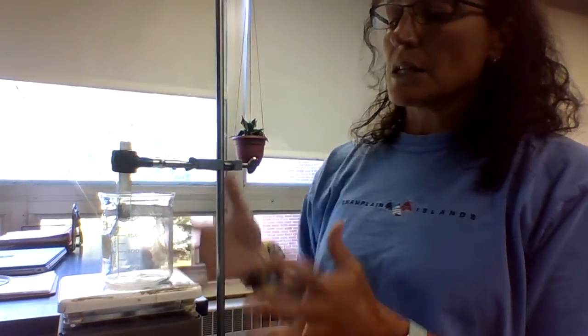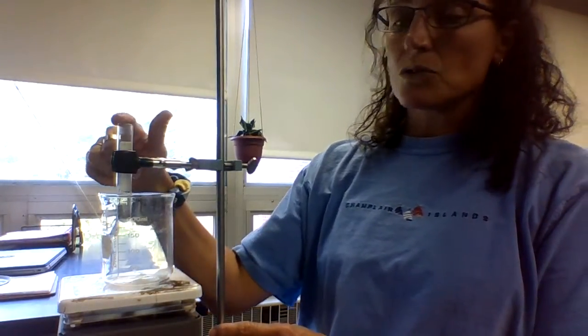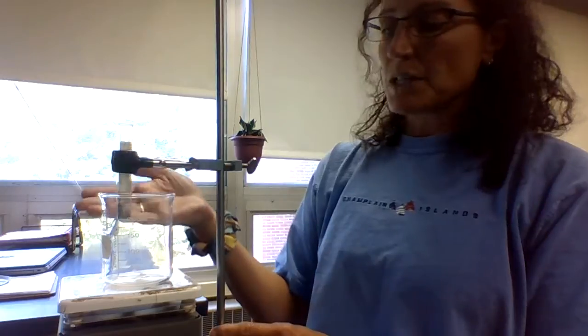And basically the ringstand allows me to clamp onto a test tube and suspend it in possibly water or whatever is asked of that particular lab. So that is the purpose and function of a ringstand.